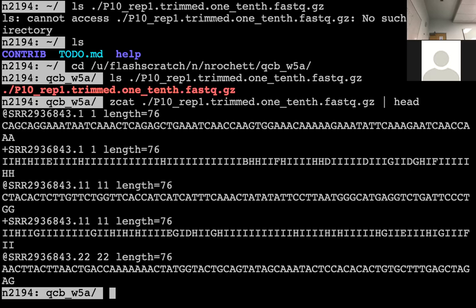I've seen some people work with a program that seems to get hundreds of processors.